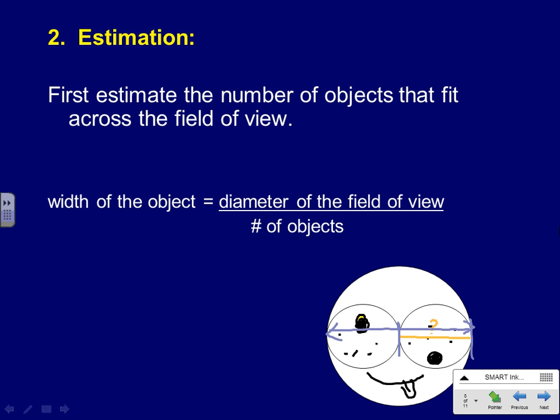So when we look at cells like onion cells versus cheek cells, what we're really comparing are plant cells versus animal cells, because we're animals, and we want to know whether there's a big size difference in those cells. So we're going to try to estimate the size of the cell, right? And we're really not getting official measurement numbers. We're just wanting to know about how big they are. Okay? All right.